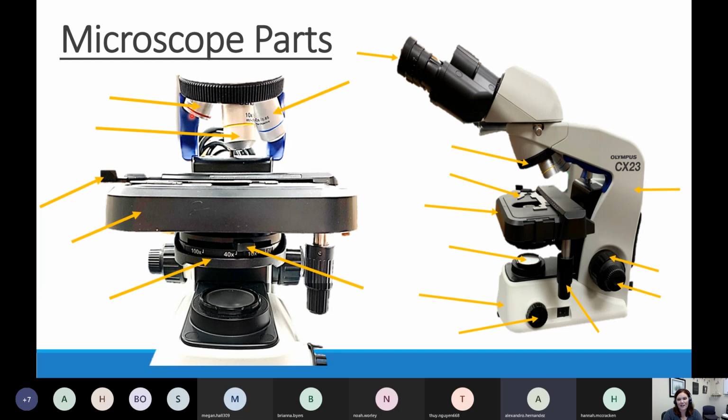So it's not much bigger, it's not even as much as the ocular, but as we'll talk about shortly, when you look at things in a microscope, it's a compound microscope. So the magnification of the ocular works together with that of the objective to make things bigger. So here's my scanning objective, my red one, that makes things 4 times bigger. Next door, we've got our yellow one. This is called the low power objective. The low power objective makes things 10 times bigger by itself. So it magnifies things the same amount as those ocular lenses do.